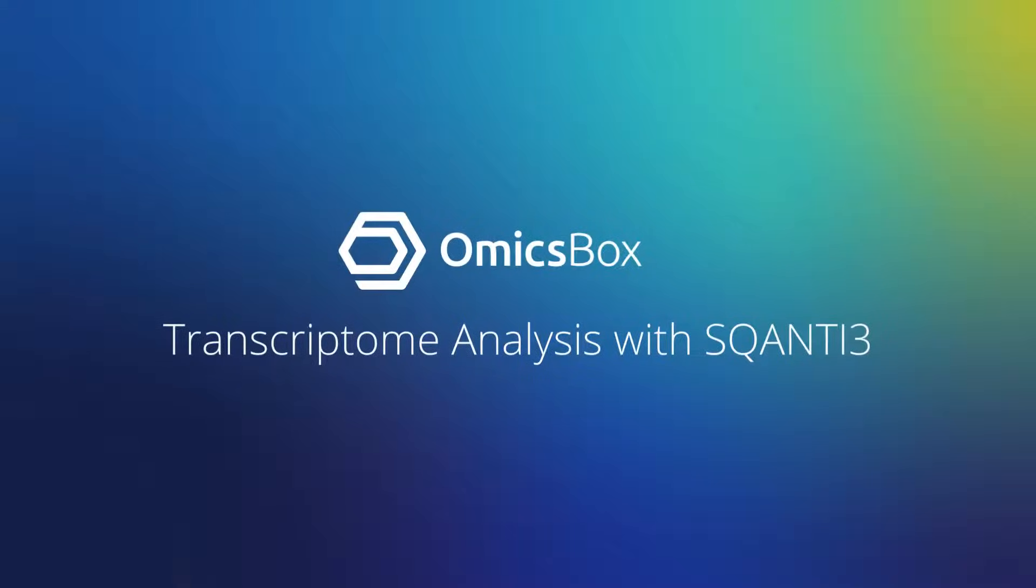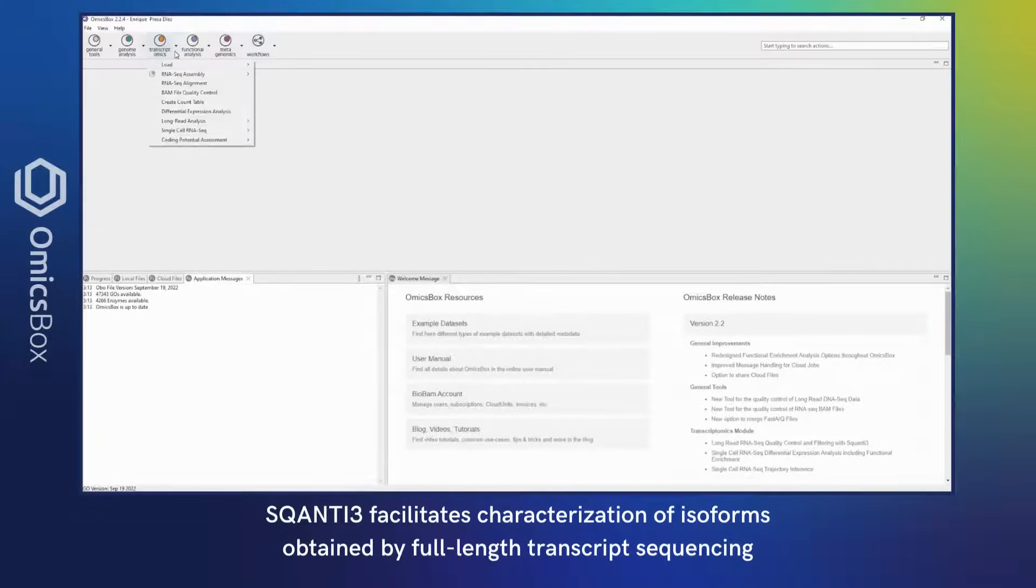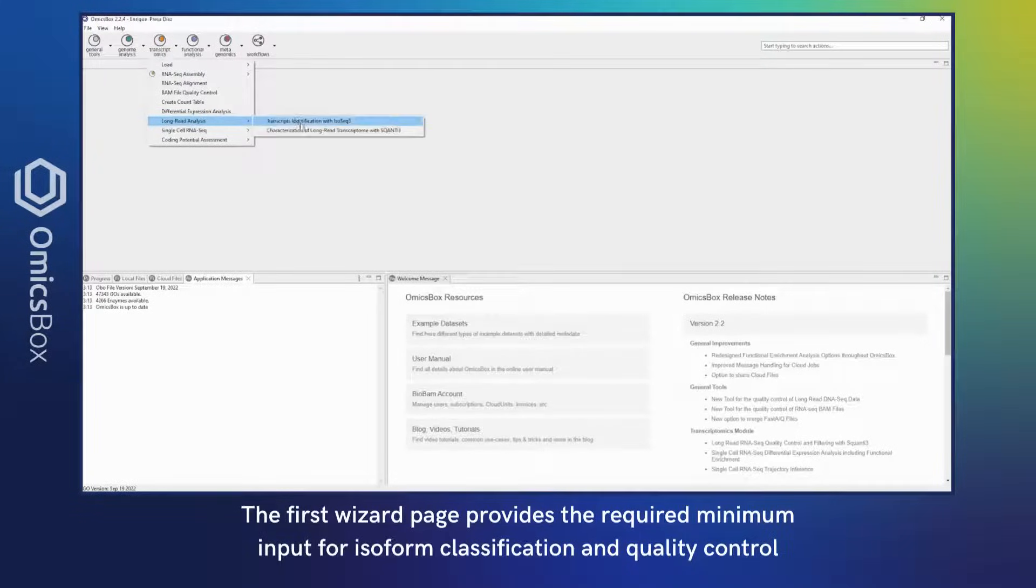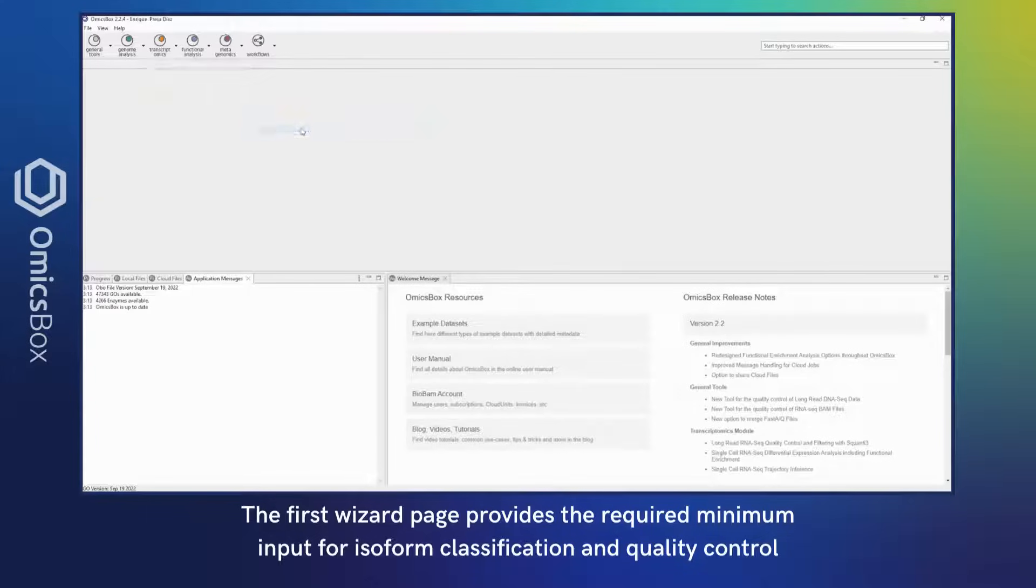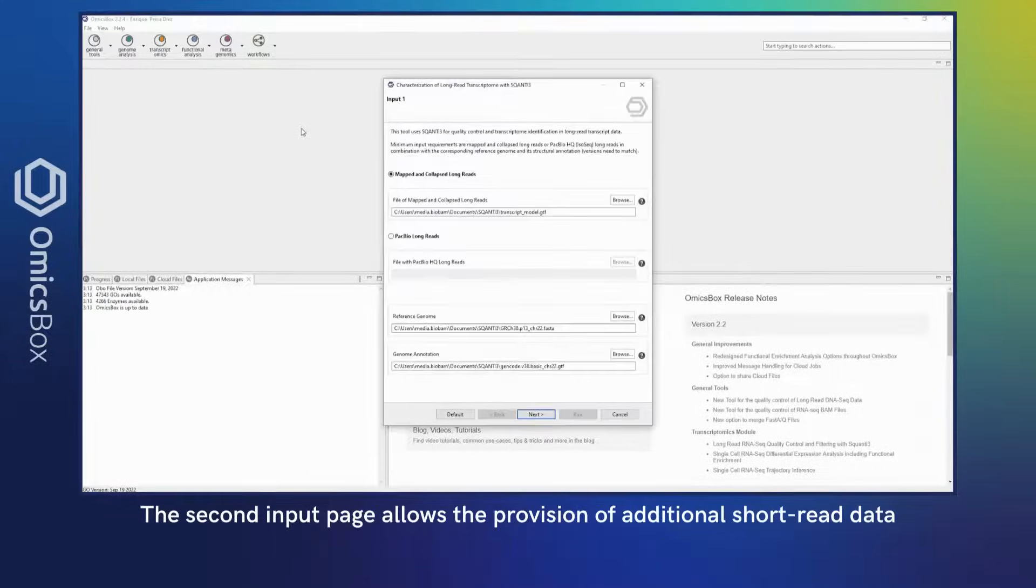SQANTI3 facilitates characterization of isoforms obtained by full-length transcript sequencing. The first wizard page provides the required minimum input for isoforms classification and quality control.